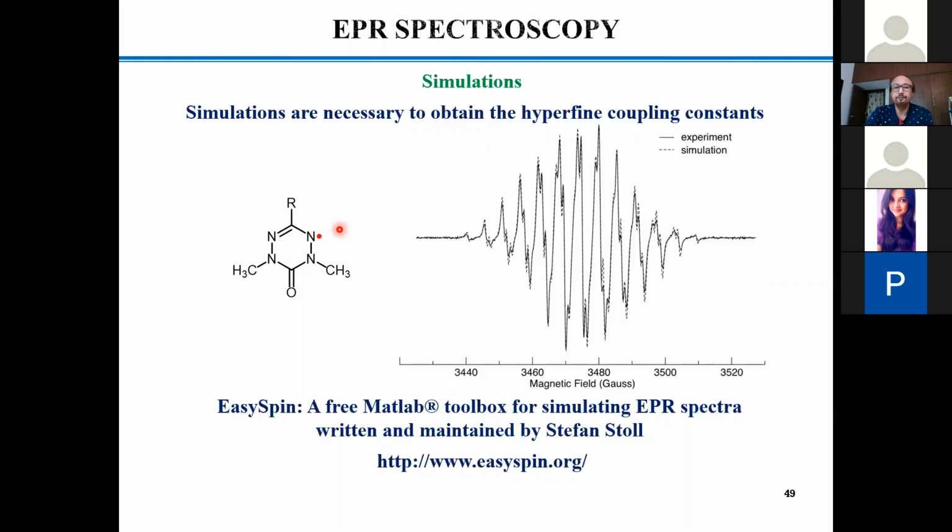Okay. But CH3 is also only 3 bonds from the N. No, CH3 you have to understand from this nitrogen center. It is more of a hypothetical question, because the data is not there. So this is my perception that this won't come into the picture. If you go for Q band, this may come into the picture. So unless we do the experiment, we cannot make much of a judgment on this molecule.